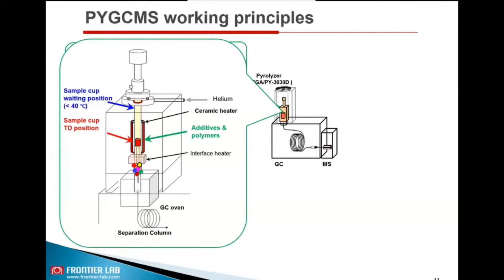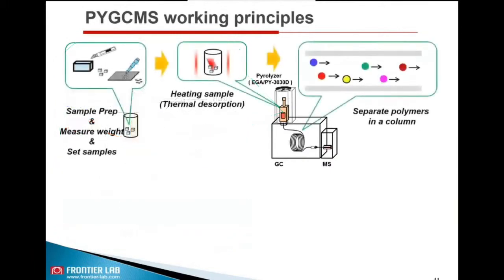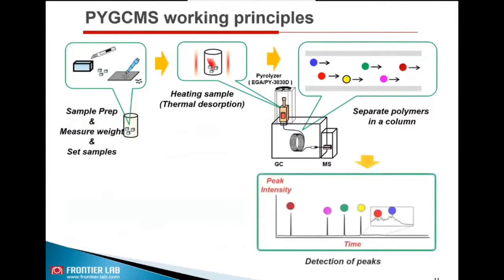Then with the help of the carrier gas, this is transferred to the GC column, and this is where you see the separation occurring, as a GC column is meant for separating individual compounds from a mixture. Then basically you get the output like a chromatogram. In this case, we call it a pyrogram. This pyrogram has multiple peaks, and each peak represents one compound that is part of the main material that you are analyzing. Here, this example is the analysis of phthalate in electronic material. That is a requirement for phthalate screening in all plastic material. So this application is just illustrating the analysis of phthalate in PVC or plastic materials.